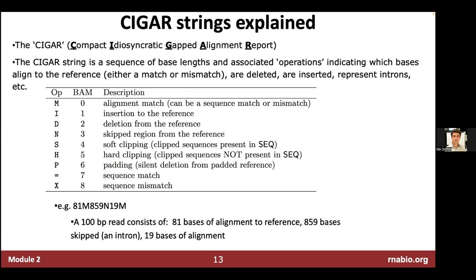Yeah, and if you sort by read name, you'll see them always right next to each other: read one, read two, read one, read two. But if you sort by position, they'll be separated in the BAM file depending on how big the fragment was. That's one of the reasons why each line in the alignment also gives you at least some basic information about where the pair is, because it could be quite far away. That helps when you're reading through the BAM file to understand the nature of the pairing.